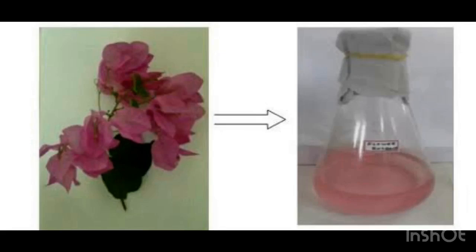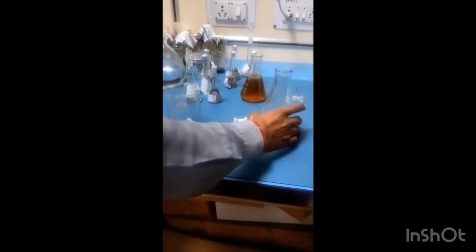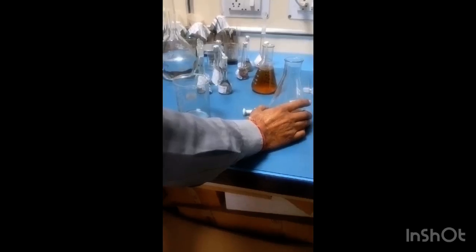0.746 gram KCl in 1 liter distilled water, forming 10 millimole potassium chloride solution. Above KCl solution is dissolved in 800 ml distilled water to make a volume to 1 liter.